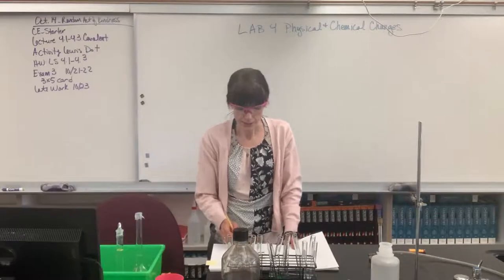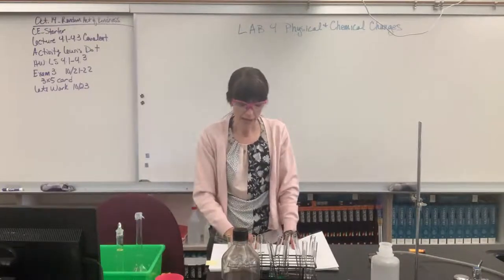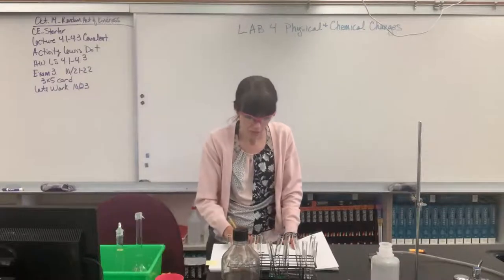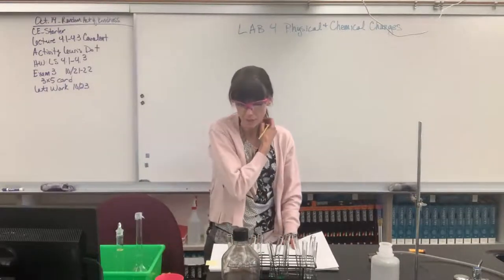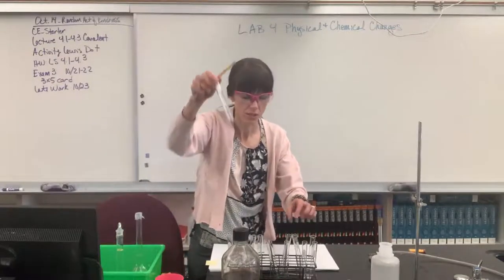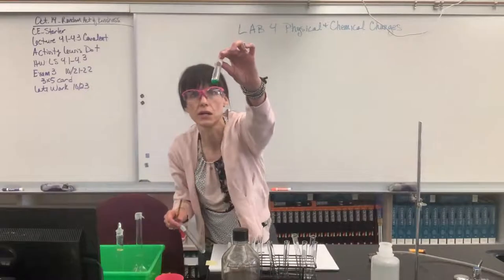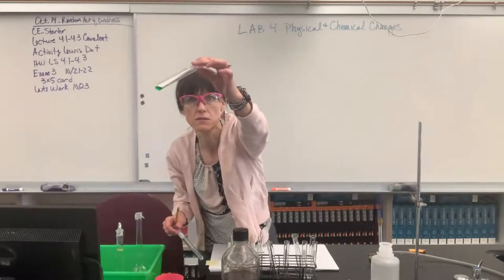Sample color is green. Unheated, it is green. And the result of adding the HCl is still green. It's maybe a little more green. This is kind of a seafoam greenish. This is like a Kelly green. That is like the green inside of grass.